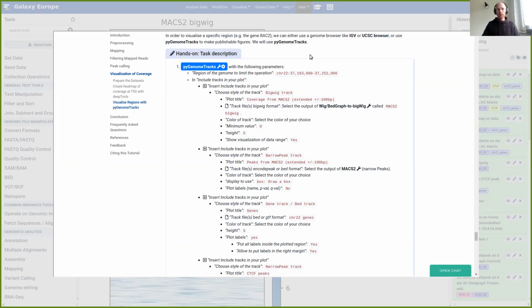And what we now want to inspect is kind of what we already did or slightly did with the plot heat map. We first of all want to check, do some of the peaks correspond to transcription start sites or intergenic Ctcf sites. On the other hand, we also want to see if we could find peaks which do not correspond to either one of them, and therefore mark other regulatory elements that might be of interest.